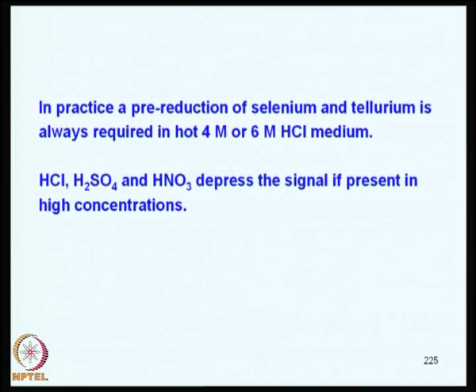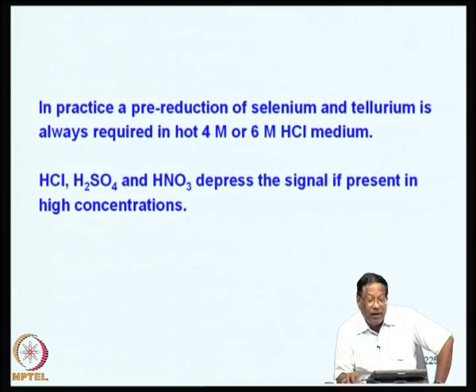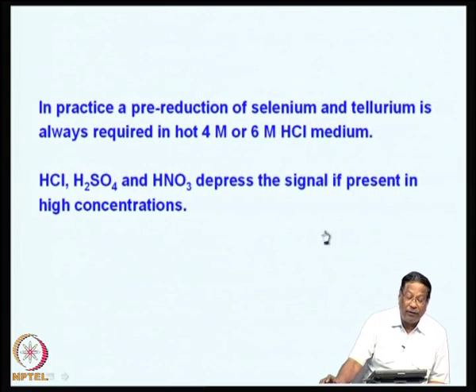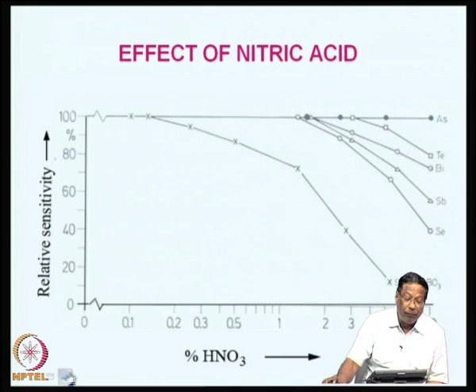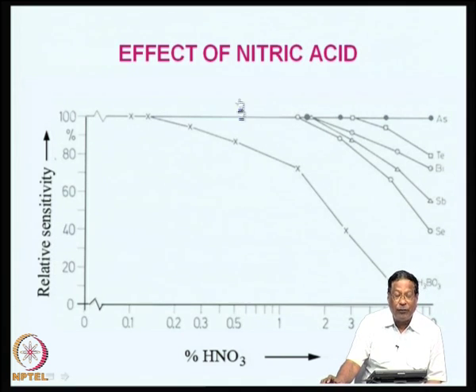Now, I would like you to understand that HCl, H2SO4 and nitric acid, all these things, if they are present in large quantities, they depress the signal. If present in high concentrations also, large quantities as well as concentration. For example, you can take a look at this figure.